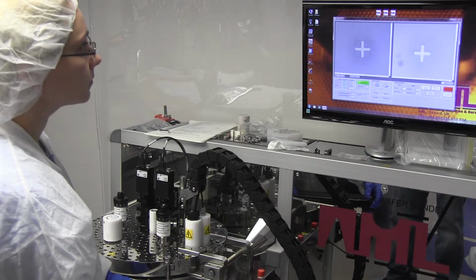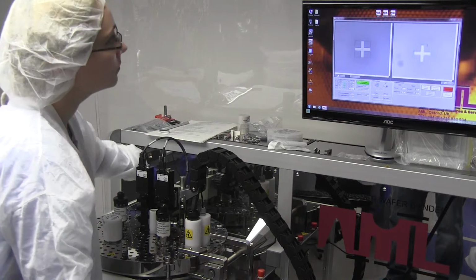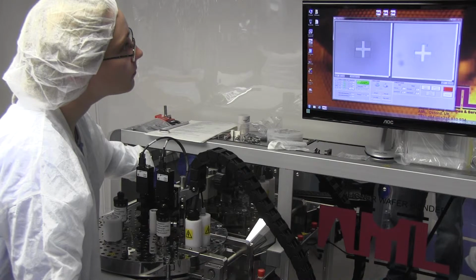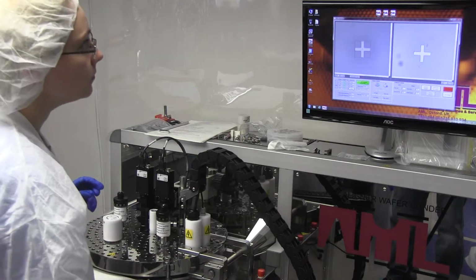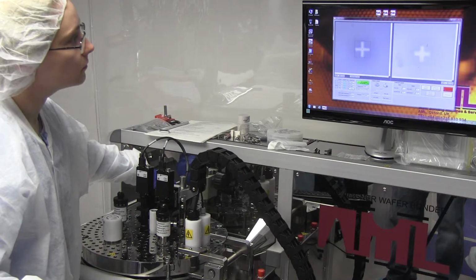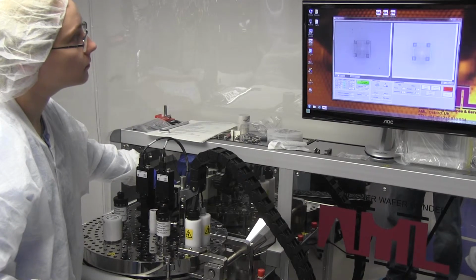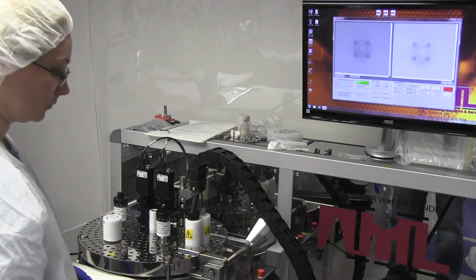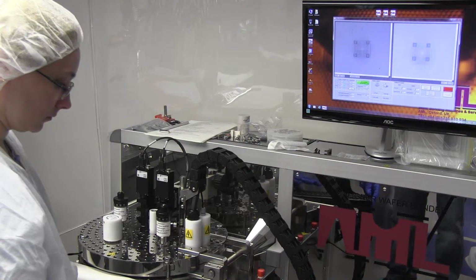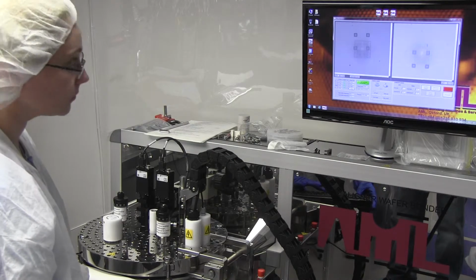When you've got the image capture in operation, when you're viewing the merged superimposed images, when you move the manipulator, there's a delay in the picture updating. The refresh rate goes from being like a live picture to like 1 frame per second. So you have to push it, wait, and then it moves, push it again, wait. So it's a bit more tedious to do. That's all a frame grabber in the PC. I think it's done by National Instruments software. It somehow merges the images, but it's slow to refresh the image on the screen.